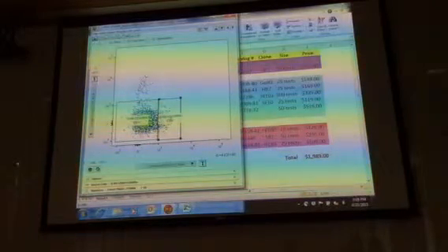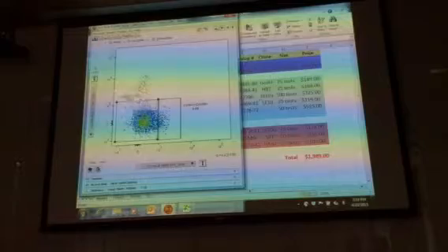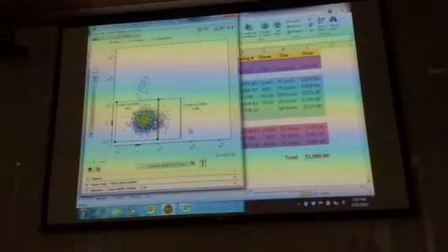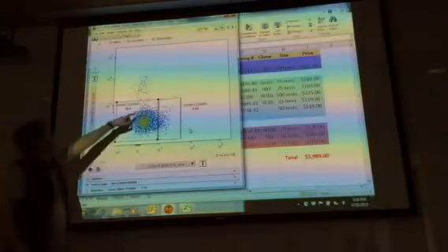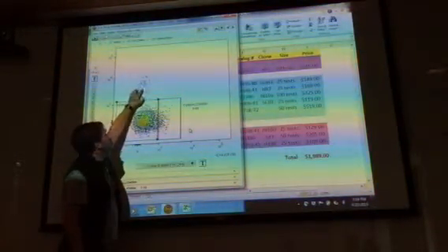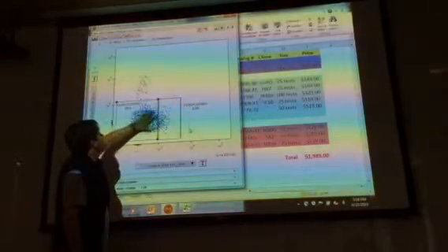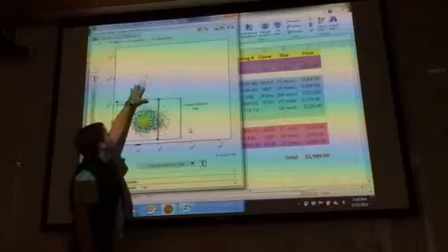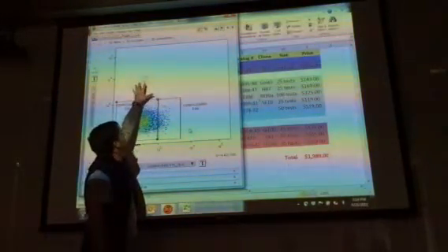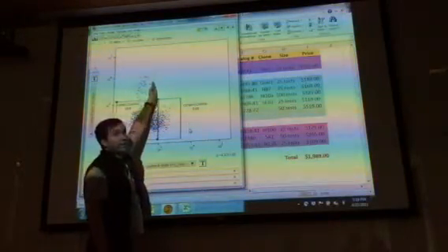So how did you decide to cut it off at that point? You can do it based upon where this is. Based upon the scatter profile like this, you could say, okay, this is a negative population. You would think this may be positive up here, but because of where this positive cell population is, you could say, okay, we could assign the cutoff here.